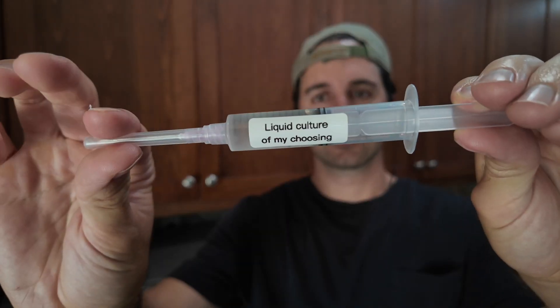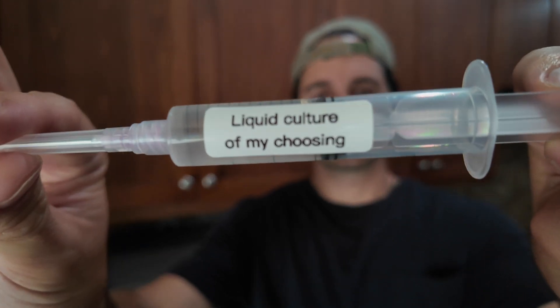For starters, we need one liquid culture of your choosing. It doesn't matter what you choose — all liquid cultures will respond about the same. You can do reishi, lion's mane, shiitake, or whatever mushroom you found out in the wild. You can reproduce a liquid culture and expand it into more liquid culture.